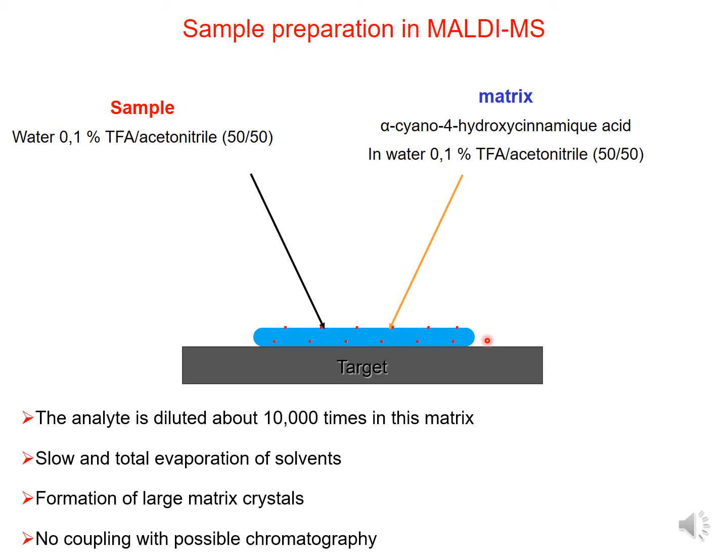We never perform MALDI on a liquid compound. This is always on a matrix, on a solid compound, a crystallized compound. And of course, if it is solid, it is not possible to perform coupling with liquid chromatography or gas chromatography. So that's a drawback of the system.